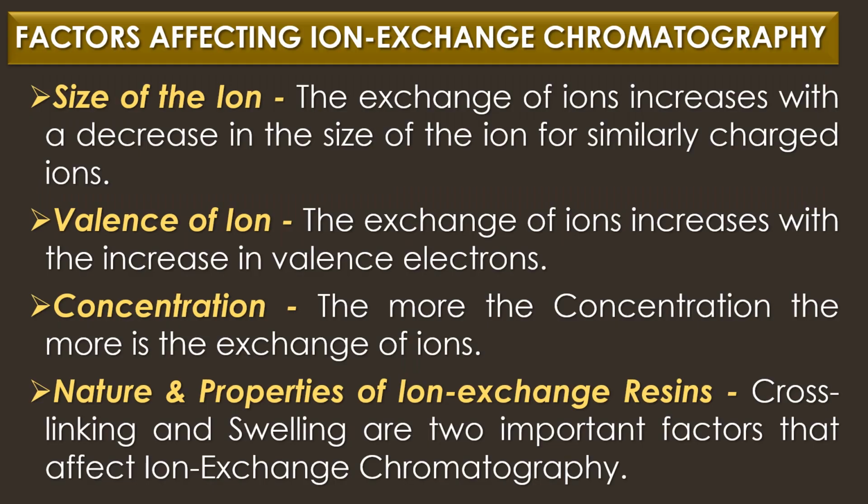Factors affecting ion exchange chromatography. Usually, four factors affect the ion exchange chromatography. They are size of the ion, valence of ion, concentration, and finally, nature and properties of ion exchange resins. The first factor is size of the ion.